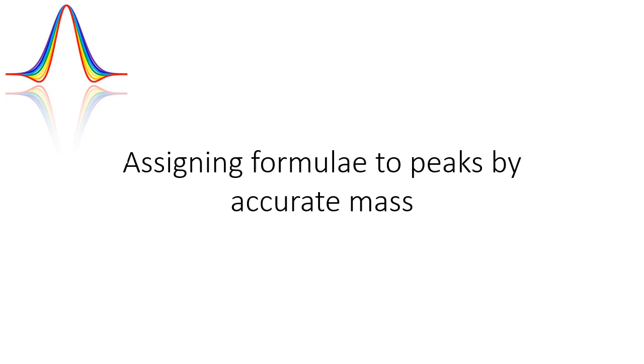Hi there. In this session, we're going to be going through the process of how you can assign an elemental formula to a peak in a mass spectrum based mainly on the accurate mass.